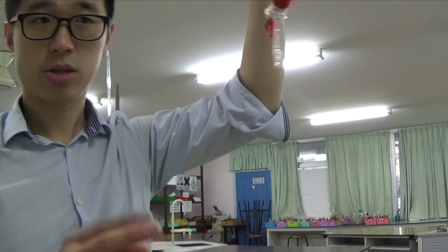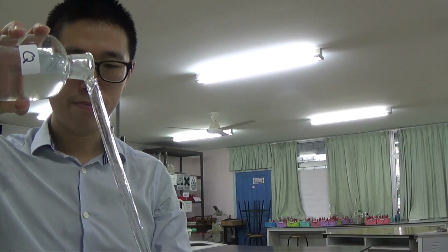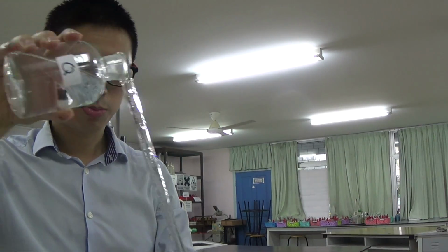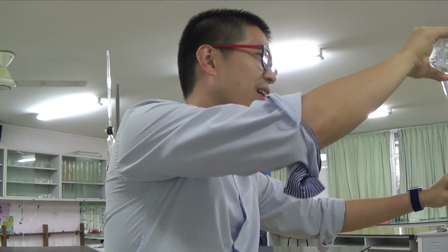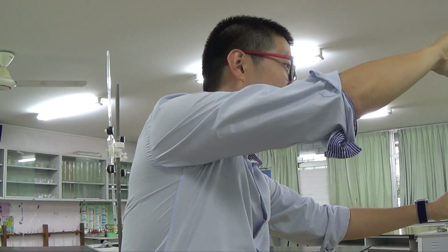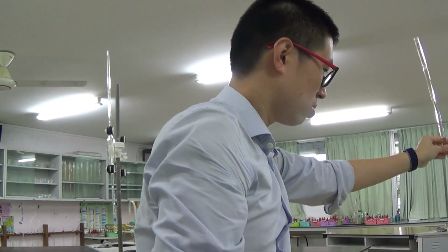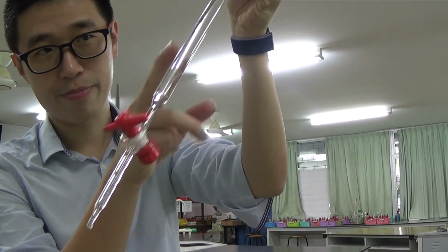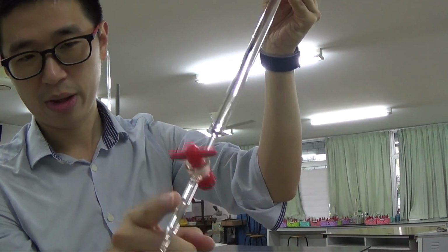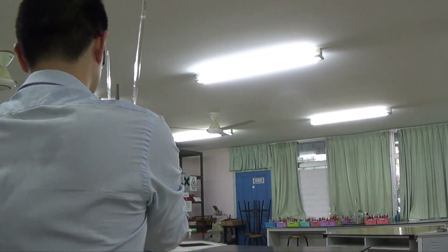Okay, now that it's almost dry, but we know that this is the sodium thiosulfate already, so we are reasonably okay. I'm just going to quickly fill my burette. Oops. Avoid filling it on the floor, because you might make the same mistake as me. Okay, so what we need to do is open the tap so that the burette with the solution that I'm filling in right now will fill up the bottom bit as well. So that much is filled already. So I can just put this up here.